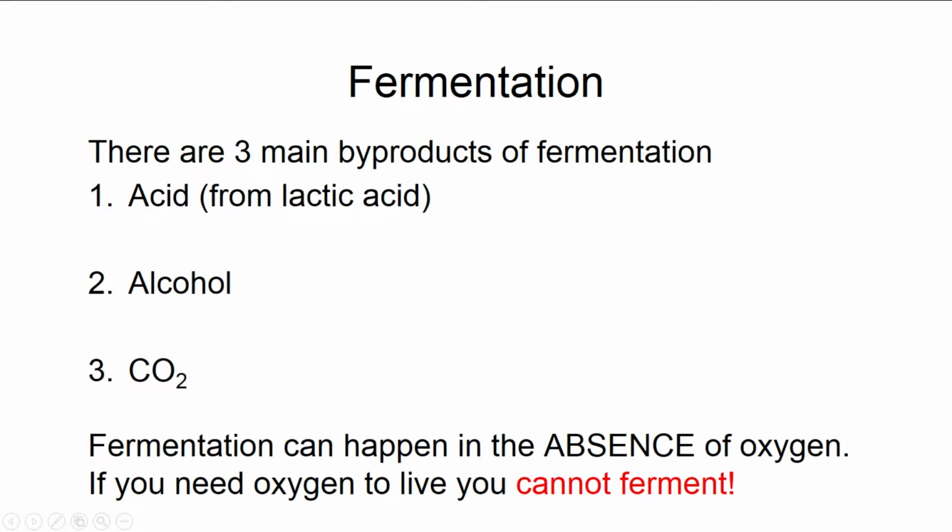They're acid, usually from lactic acid. Occasionally this isn't always true, but by and large it's true. So you'll get an acid product, you'll get alcohol, about fermenting, you'd get alcohol as a common byproduct, and last but not least is CO2. Now alcohol, pretty hard to test for, not really worth it, but acid and CO2 are really easy to test for, so we use those quite a bit.